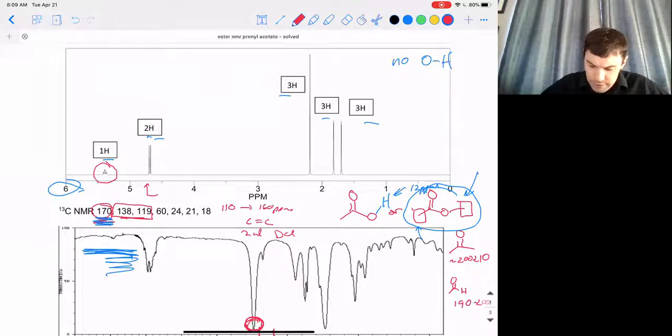Okay, next big clue, I love singlets. So if I'm going to look in the 1H NMR for a dead giveaway signal that'll help me put a group in place, it's going to be a singlet for 3 H's. And the reason for that is that it always has to be some isolating group plus a methyl.